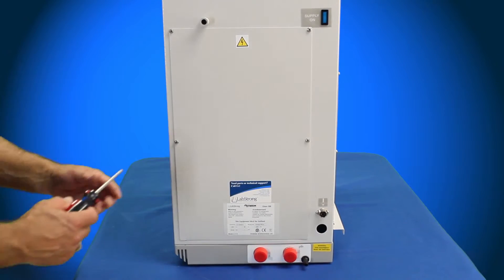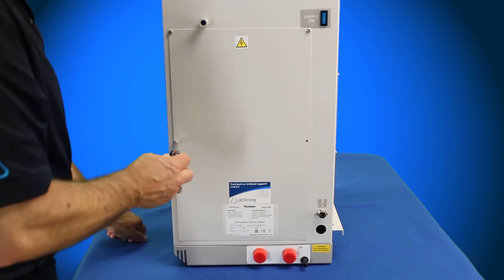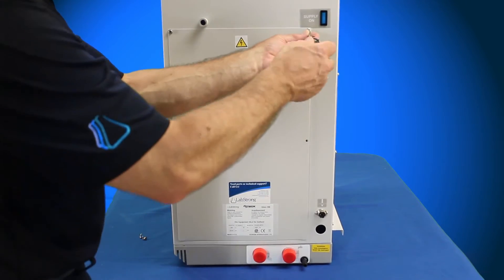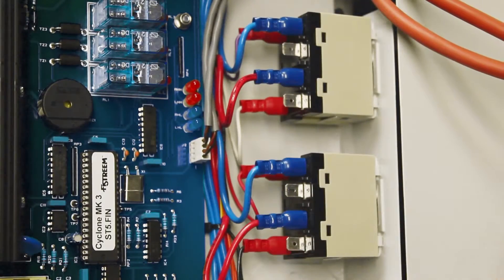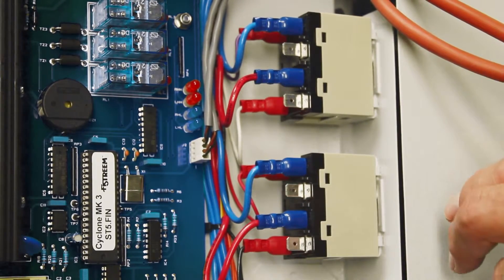Now that we have the four heating elements installed into the boiler and the top cover back on, we're going to need to gain access to the right side panel, which is where our power relays are — and this is where we're going to need to connect up our heating elements. For the 5-Stream 3 8-liter per hour system, we have two power relays.